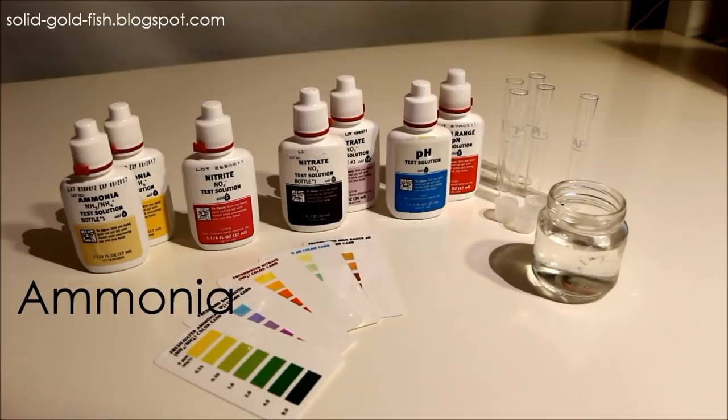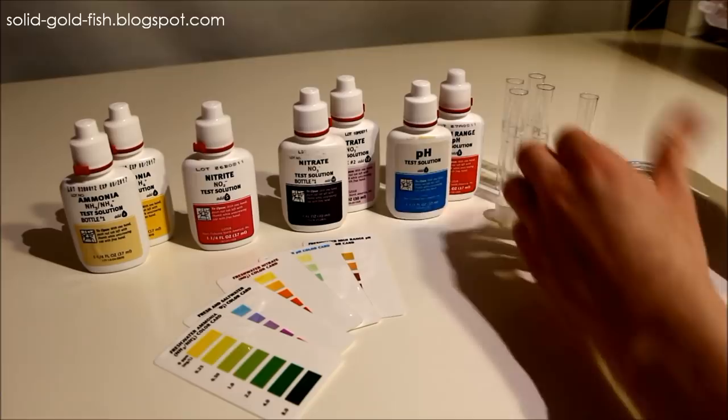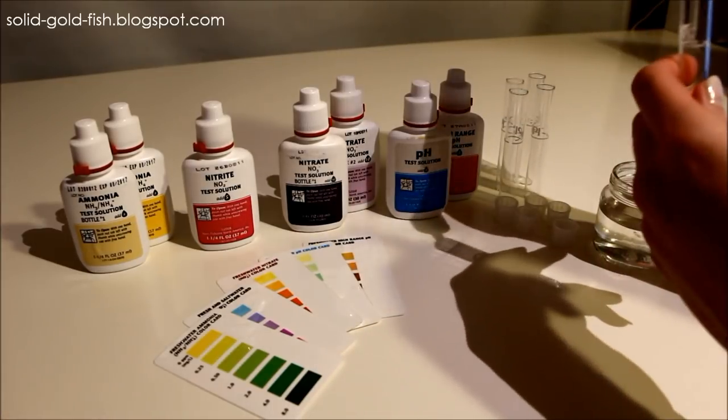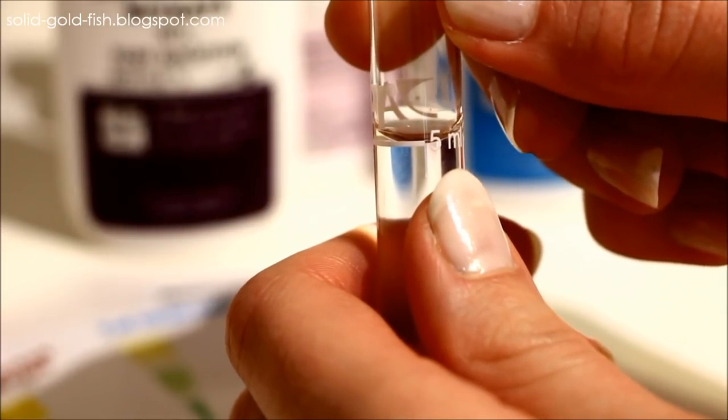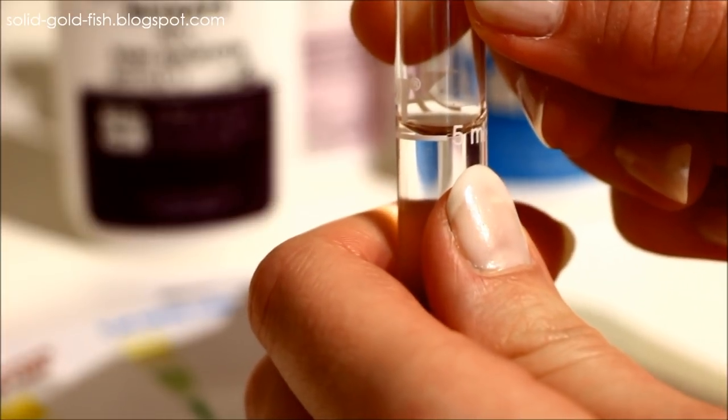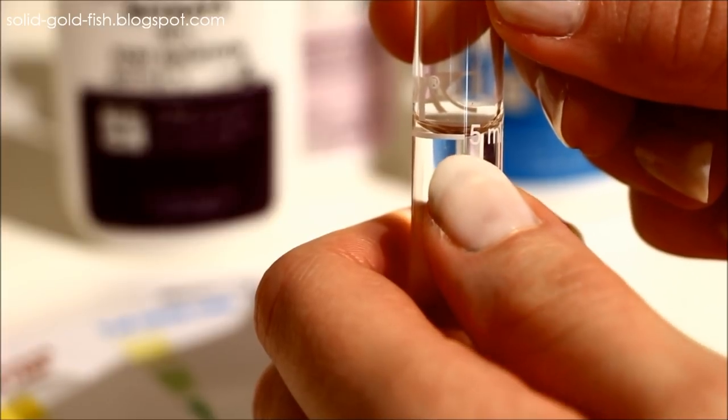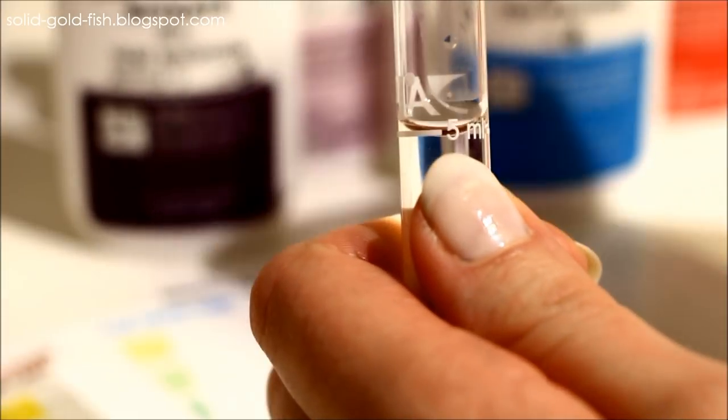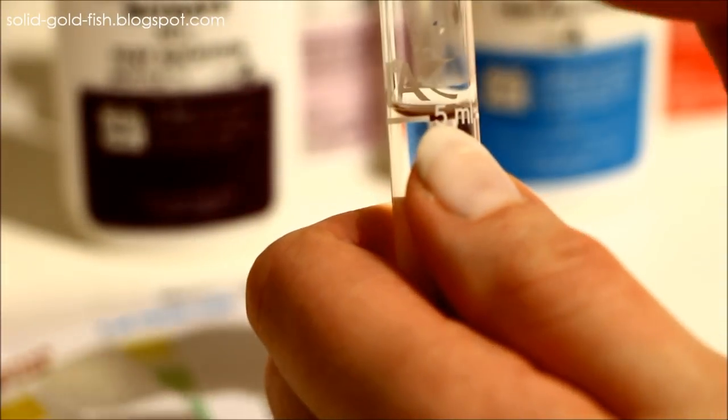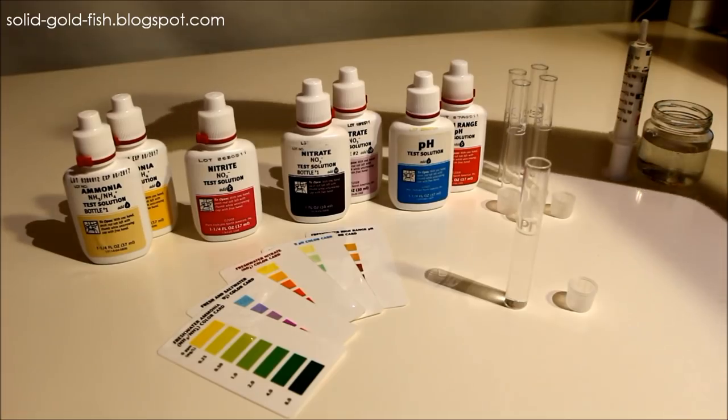What you'll do is get some water in your test tube and you want to fill it up to this five milliliter mark. If you look closely at the test tube you can see the surface of the water forms kind of a dip down in the middle and this is called the meniscus. It's just because the water clings to the surface of the glass where it's touching. You want to make sure that the bottom of this meniscus is touching the five milliliter mark and not the top.